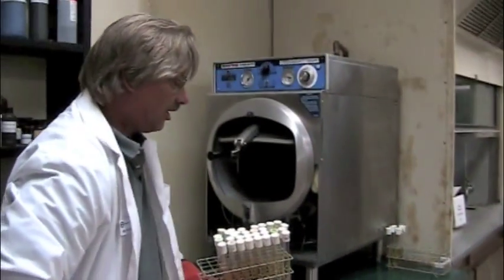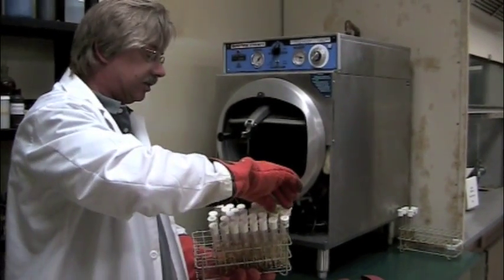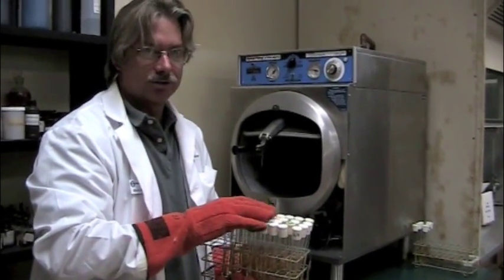Sometimes a cap falls off, and what you do is pick it up within three seconds — it's called the three-second rule. If you pick it up off the floor in three seconds or less, it's still considered sterile.